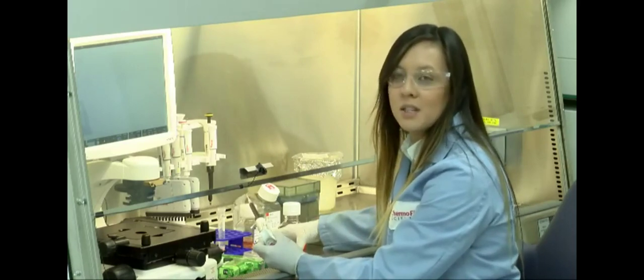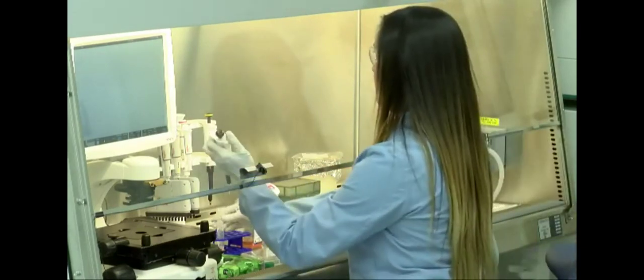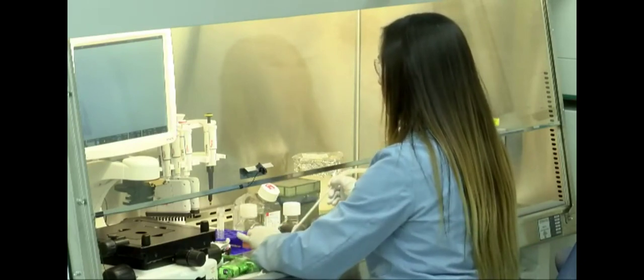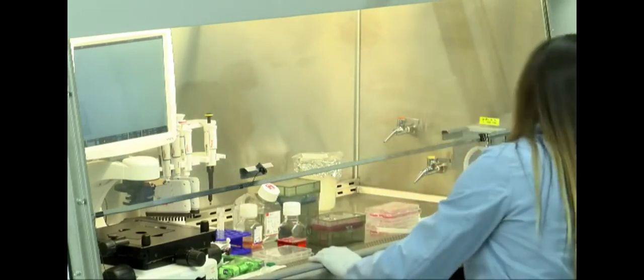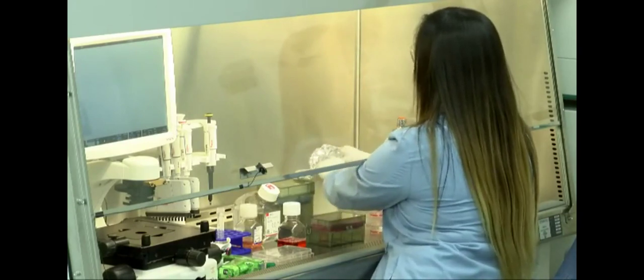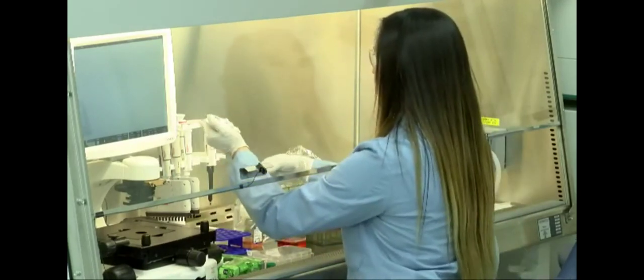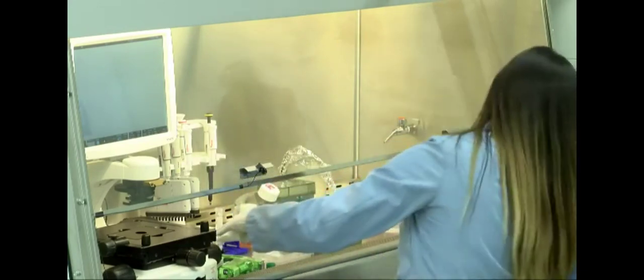So 4 times 10 to the 4 cells per centimeter squared, which equates to about a million cells per 6 well plate, so per 1 well of a 6 well. So I'm actually going to aspirate off this mouse laminin. And then I'm going to get another Eppendorf tube and take my 1 million cells from my resuspension. Add an additional mil of media.